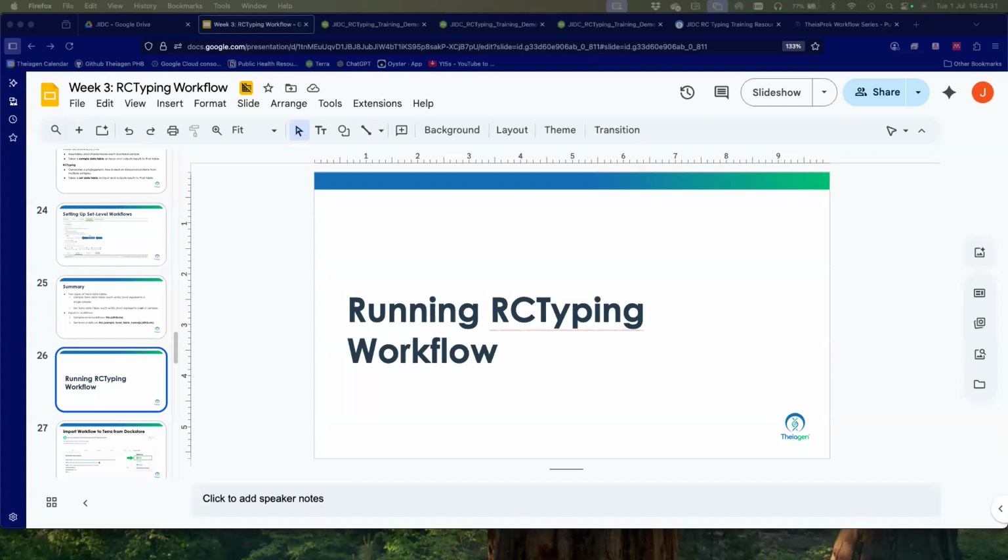So I, Rotimi, have not investigated if there is, and probably there is, a workflow that can actually gzip within Terra, which is sample level.